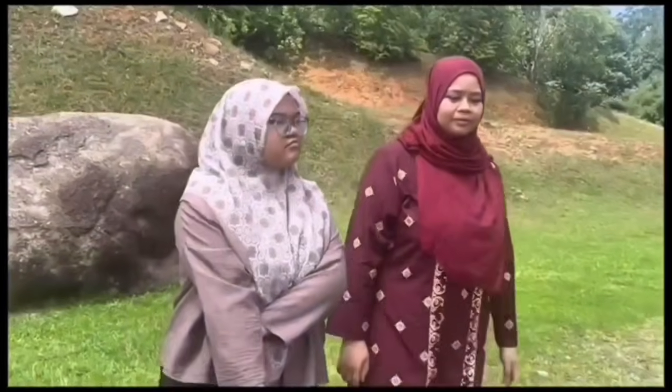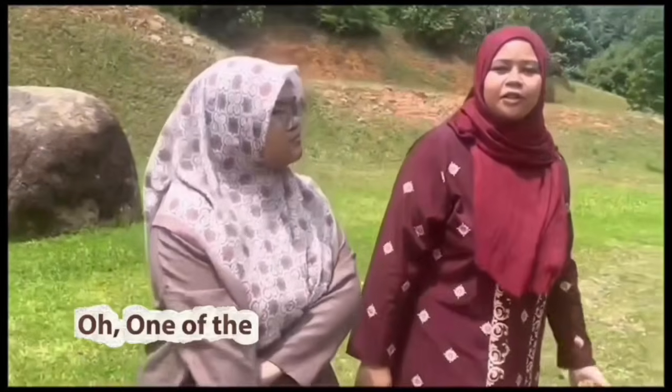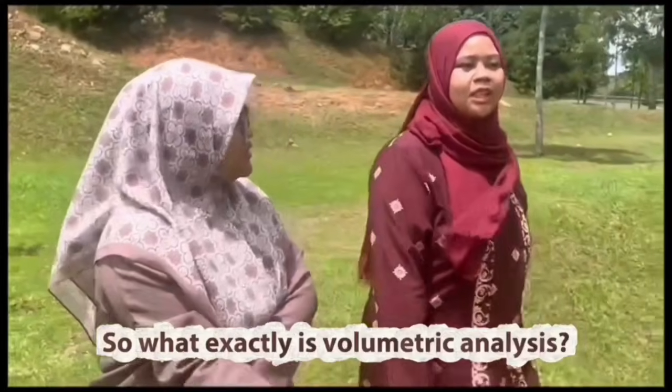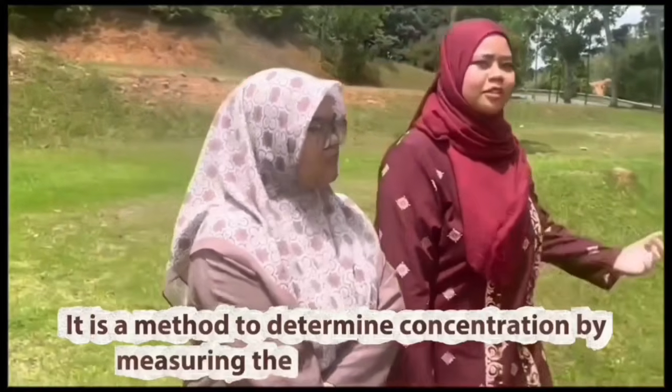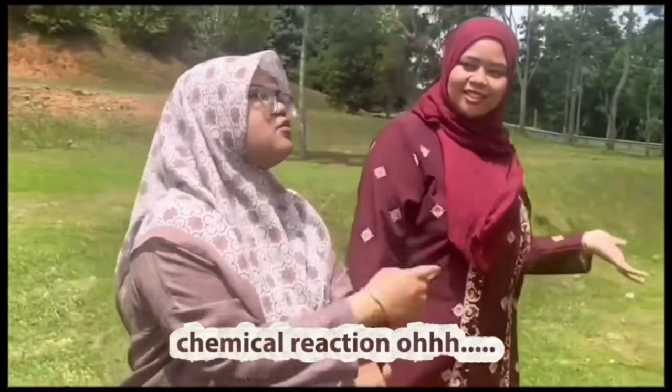Lena, how do chemists make sure the concentration is correct? One of the methods commonly used is volumetric analysis. So what exactly is volumetric analysis? It is a method to determine concentration by measuring the volume required for a chemical reaction.